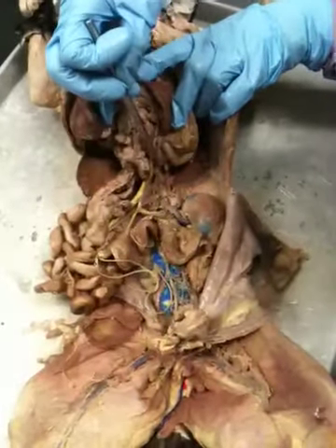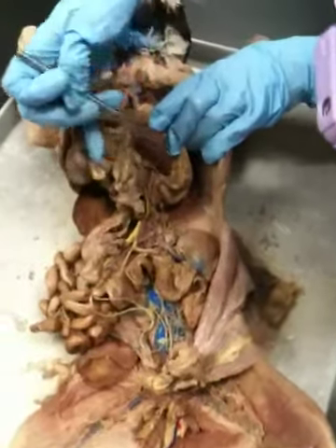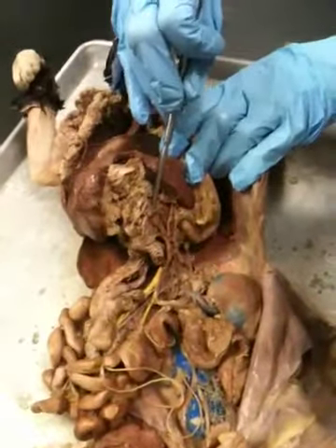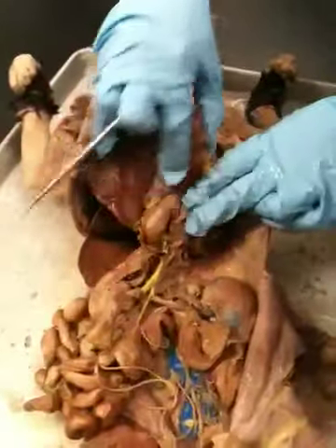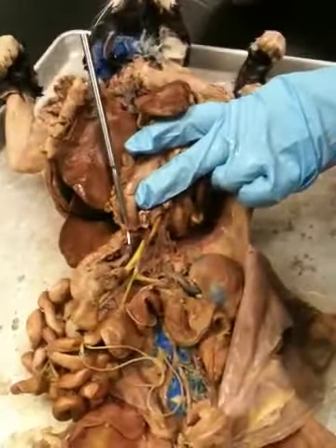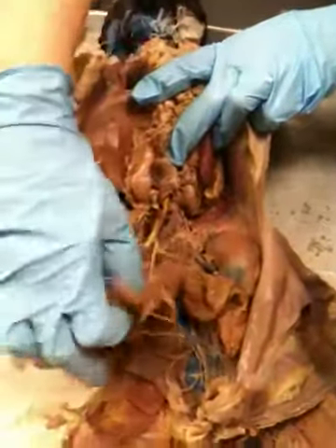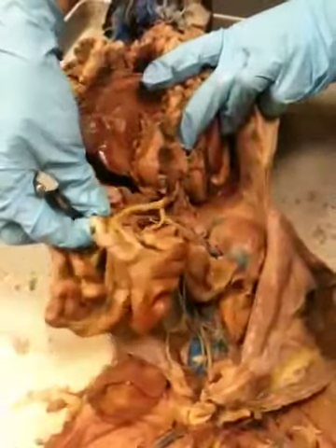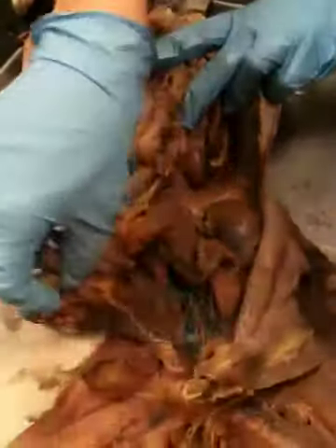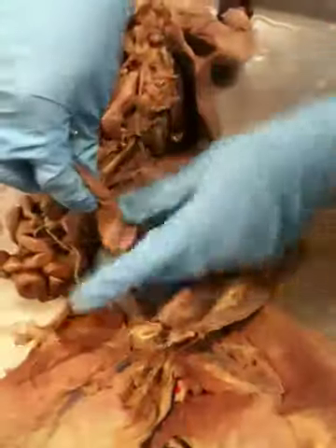Alright, and this thing here is the celiac trunk, and you can tell because it splits into all these pieces up here. You have one coming in this way to the spleen, that's splenic, and this one is gastric. Then we saw the one coming out laterally here, that's hepatic. And this one below it, going to the small intestine, is the superior mesenteric. The one going to the large intestine is inferior. Let's see if we can find that one. There it is, inferior mesenteric.